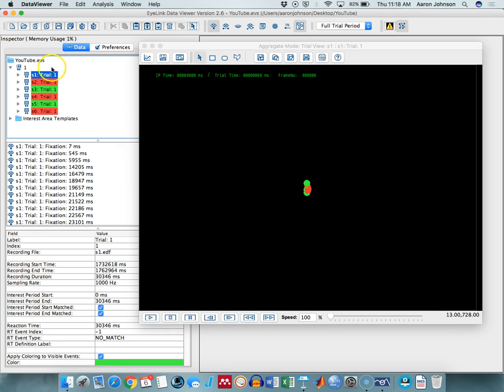Likewise, I forgot to say as well, if you have, for example, males versus females, if you clicked on the dynamic heat map, it would generate only a heat map for males or only a heat map for females. At the moment, you can't have two groups of heat maps superimposed on the same video, unfortunately. Maybe they'll do that in the future, but for now, if you want to compare conditions in a video, the swarm analysis is the only way to do it.